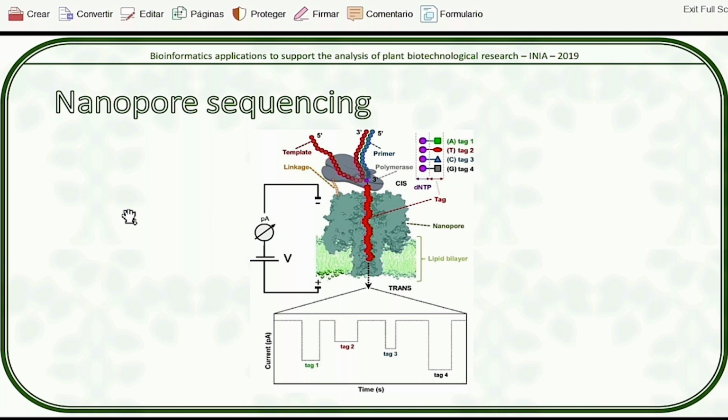The particularity of the human Y chromosome is that it was done using exclusively nanopore data, nothing else. One contig. We're going to touch on that later, but the difference between a scaffold and a contig is that in a contig you have no gaps. You know the sequence from start to end, and every single spot has a nucleotide there.